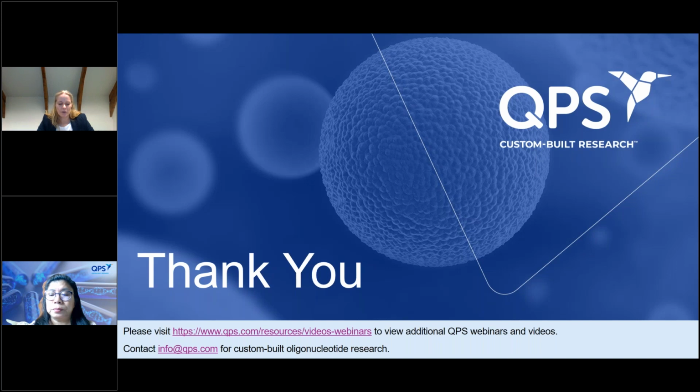So, for example, we have set up different assays, and you get, for example, the retina tissue, or you get the lens. What you first do is you weigh a certain amount of tissue, and you put that into the Precellys tube for the homogenization step. So with the beads in there, they will squeeze and wash the material, and that helps to homogenize the sample. Now it depends on how rigid your sample is. If you have tissue samples that are more rigid, then you use a different Precellys tube with different beads in there to get the tissue well degraded and homogenized.